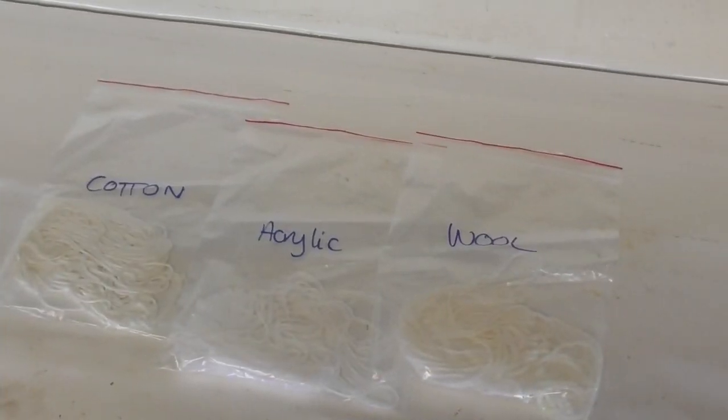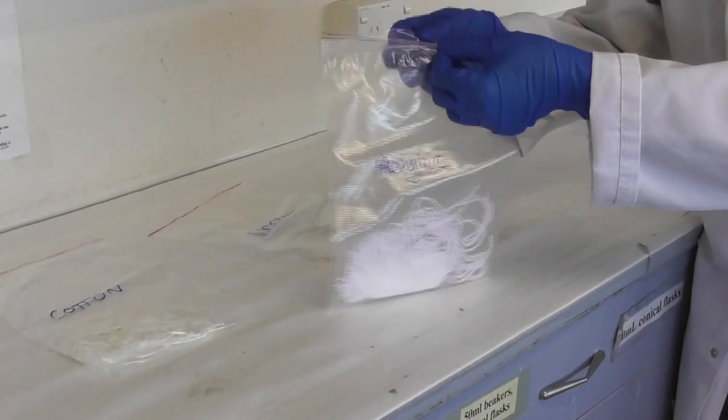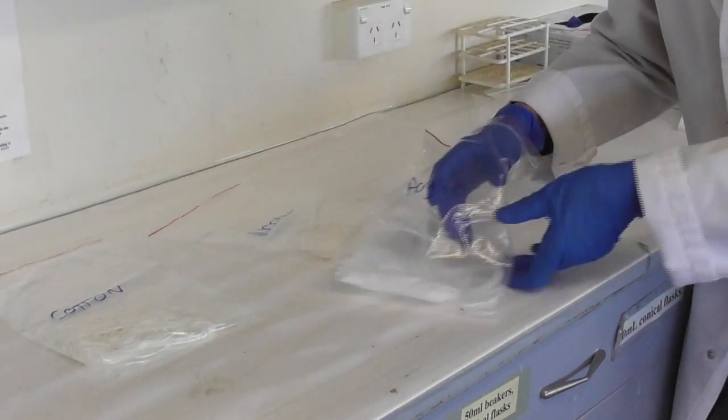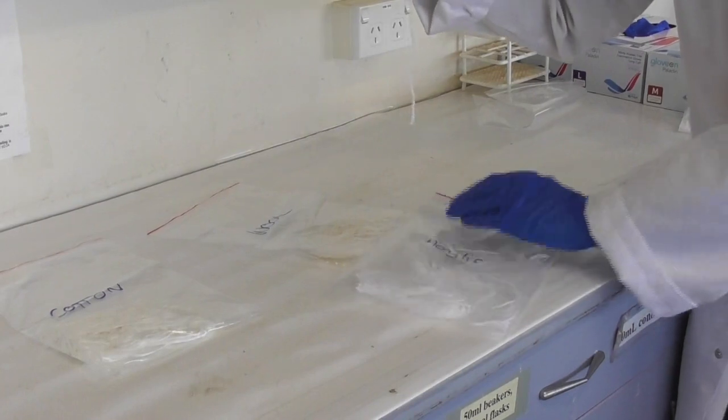We will investigate the fastening of three different types of string: cotton, acrylic and wool. We take out one piece of string at a time so as to not get confused between the different varieties.